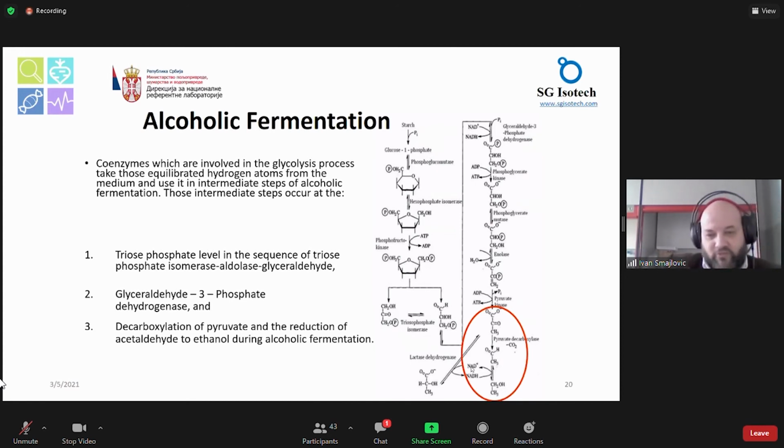So if you add water, it means that your matrix will exchange. You will have a different profile, and NAD will take a different ratio of deuterium and hydrogen and integrate them into this carbon, and then we can see this.